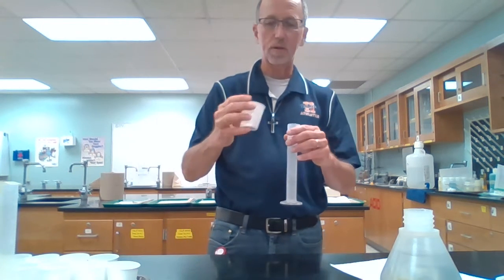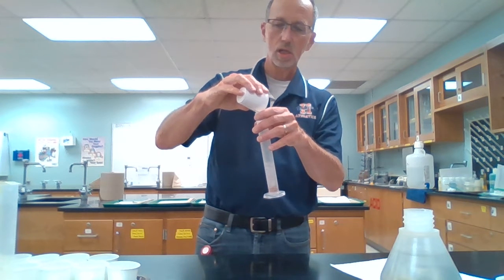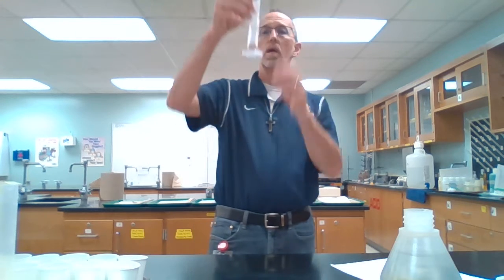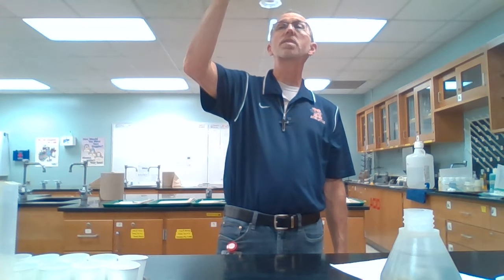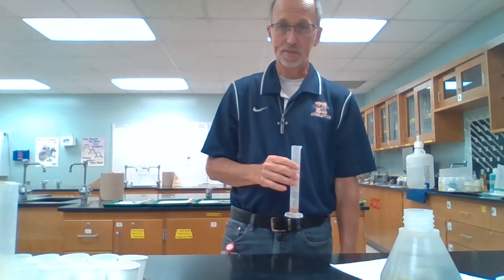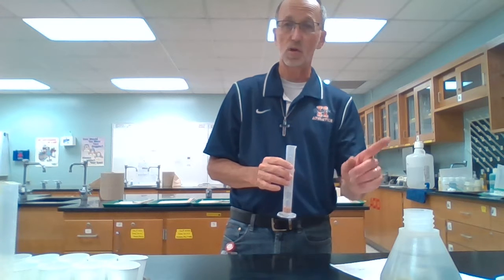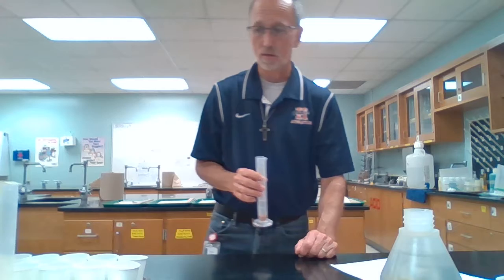So let me put the copper in there. And it has gone up to 17.2. So that would give us a volume then of 2.2 mLs. Remember, with these graduated cylinders, the value of the smallest marking is the ones place, and so we would have to go to the tenths. So 2.2 mLs for sample 1 of copper.